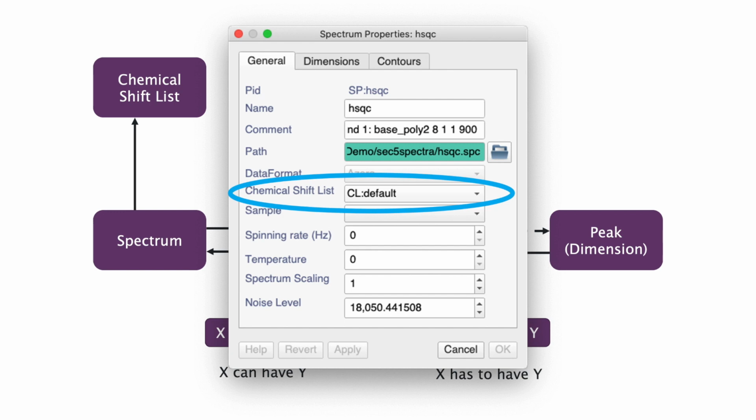Any time you have a set of spectra that give rise to different chemical shifts, then that set of spectra should be associated with its own chemical shift list. Because as you will see in a moment, the chemical shifts get averaged across different peaks, peak lists and spectra. And so you don't want your chemical shift lists from your complex being averaged with the chemical shifts from your free protein. Otherwise you'll end up with weird chemical shifts and will deposit incorrect ones with the BMRB.